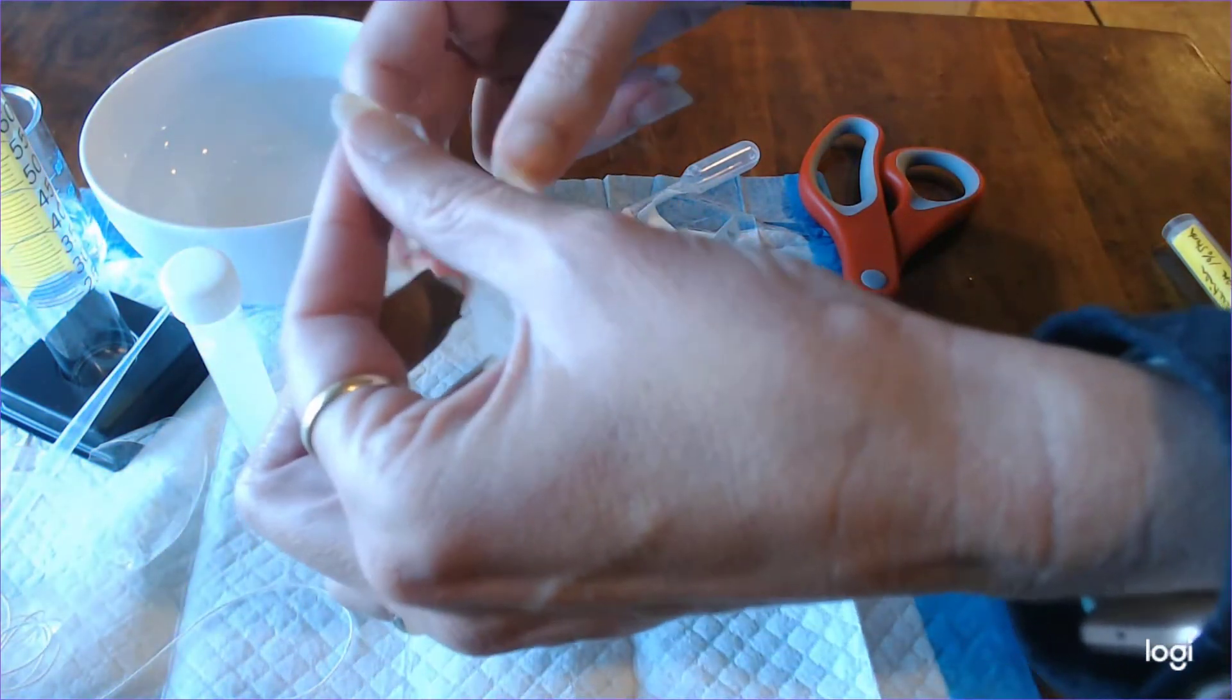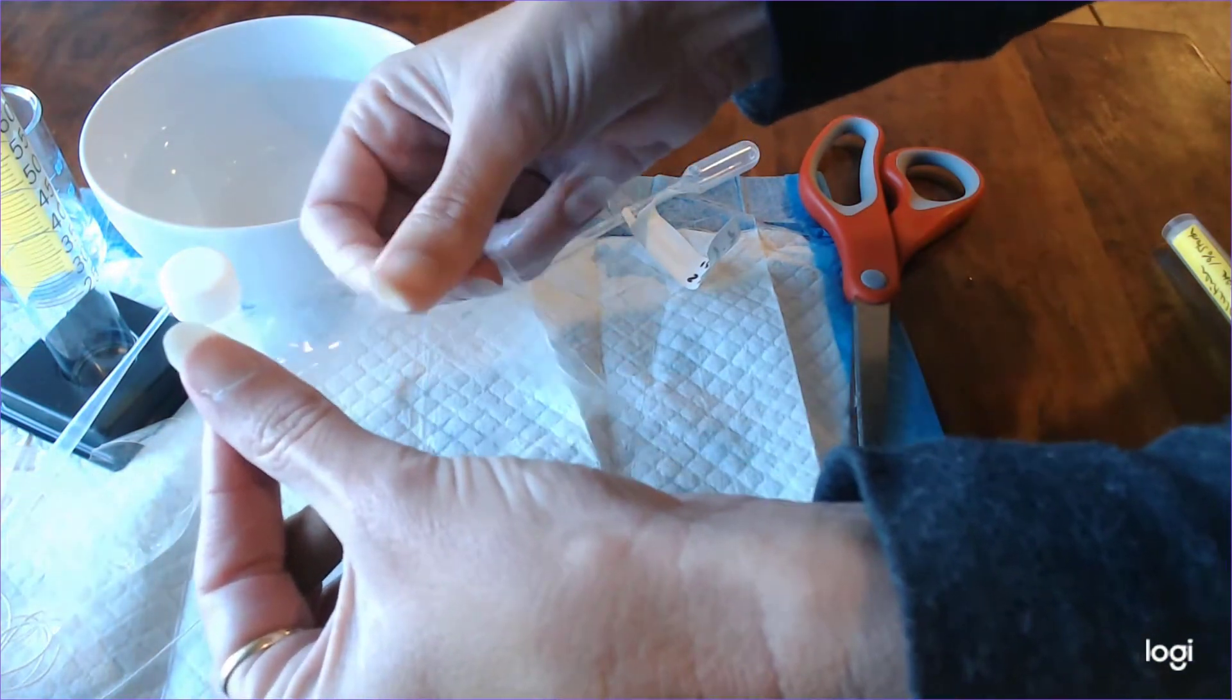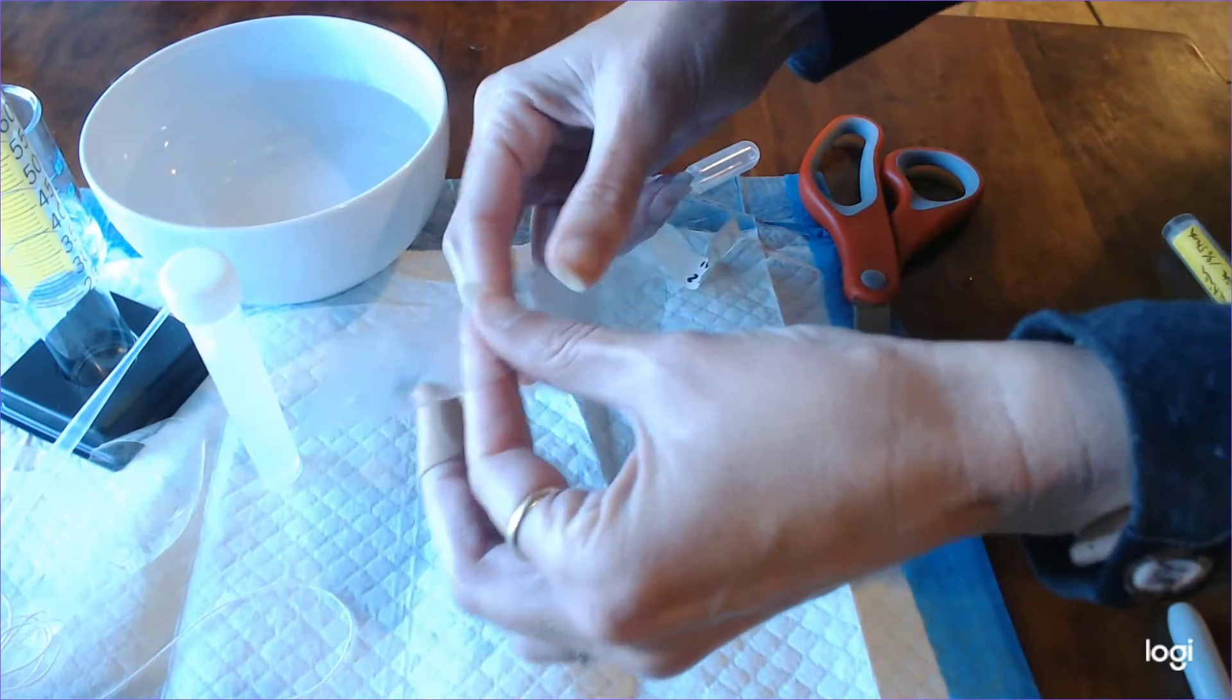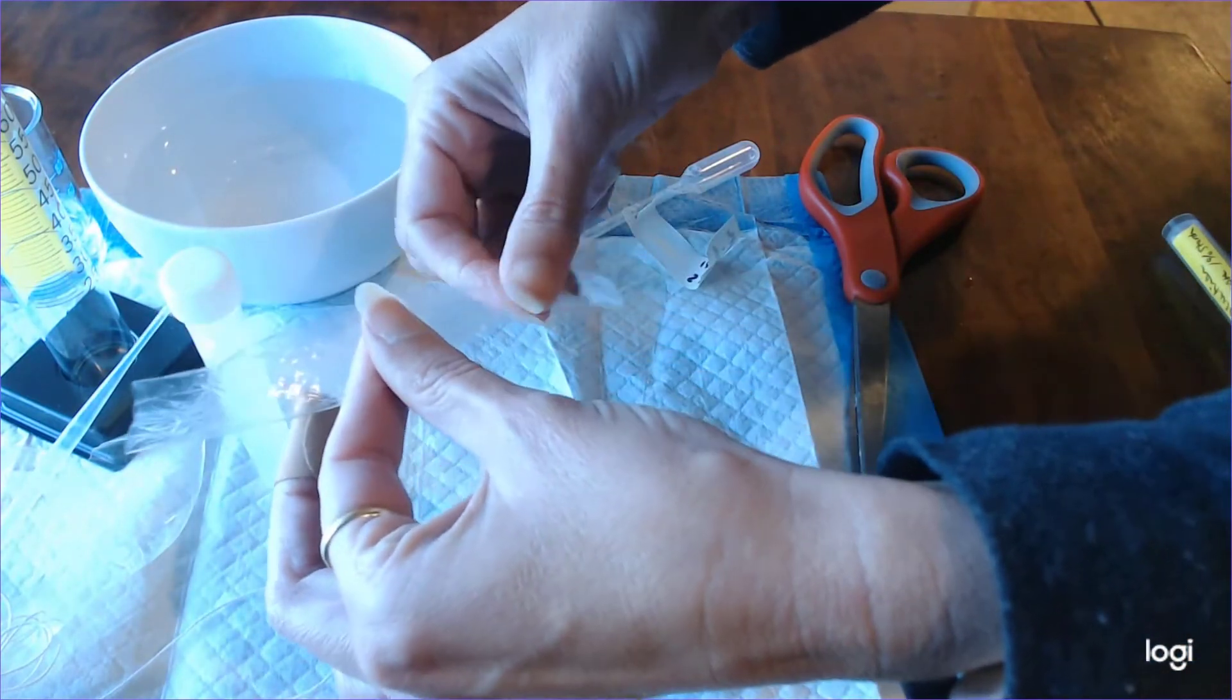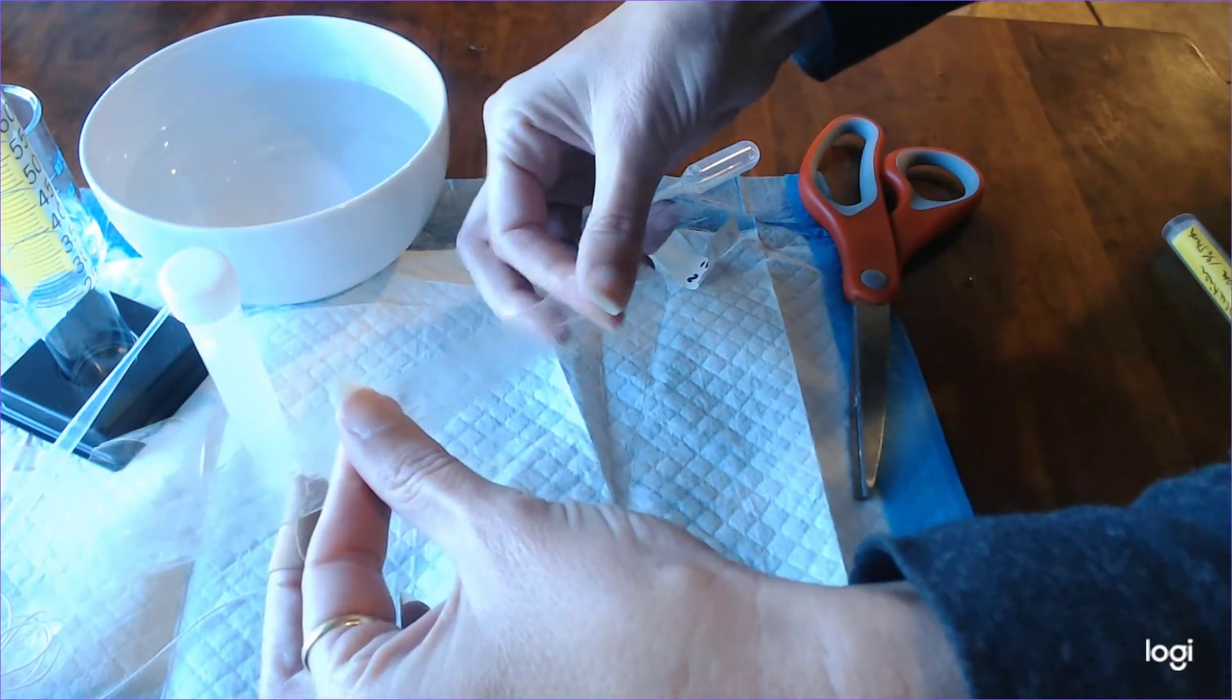So once you have one end separated like that, keep rolling the tubing in between your fingers and get good separation all the way down the length of the dialysis tubing so that both the top and the bottom have good openings to them.